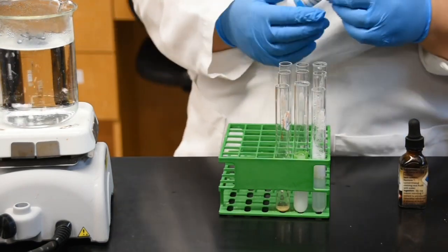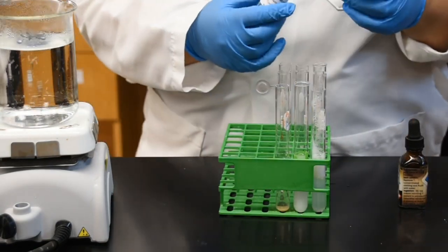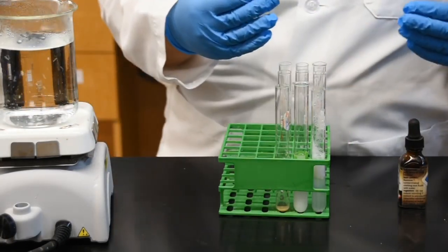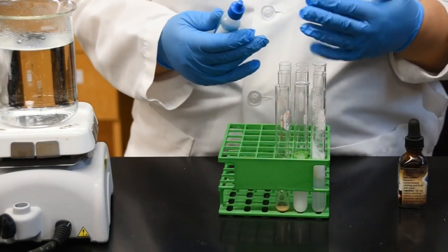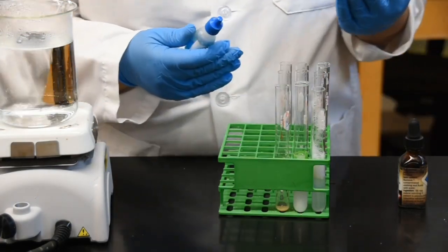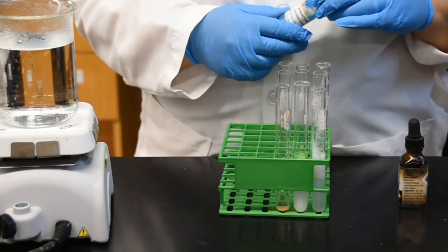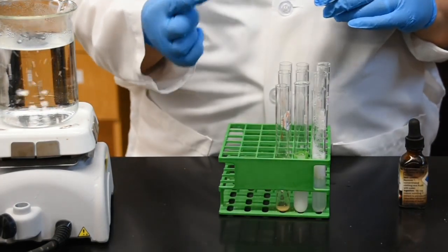If the sugar amount is little, then your color will be yellowish. If there is more sugar, then it will be orange. And lastly, if there is a high concentration of simple sugars, then your color will be red. If there is no simple sugar in your sample, then the color stays as the original blue.